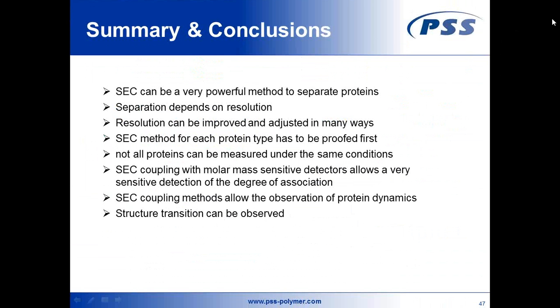You mentioned that if a protein is large enough, you could actually get some information on the radius of gyration in light scattering. And the question there is, what is large enough?